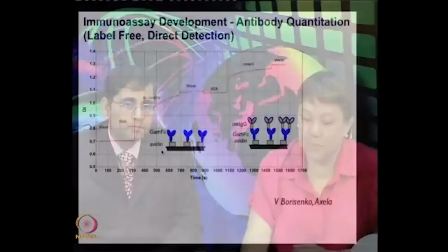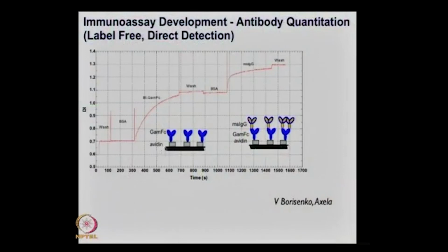In fact, the challenge with cells is we have to redesign the lines, because the lines we originally have are about 1.5 microns. But cells are bigger than that, and so we have to redo the whole thing with a much bigger line. So a different setting has to be used. But it's the same principle, and in fact, it's very simple to detect cells. Sure. This example is an antibody immunoassay, so you can play games on that.